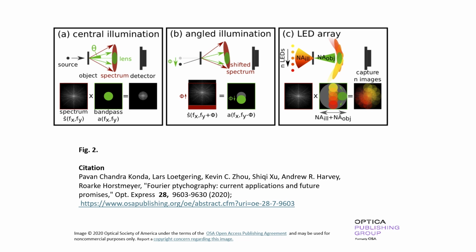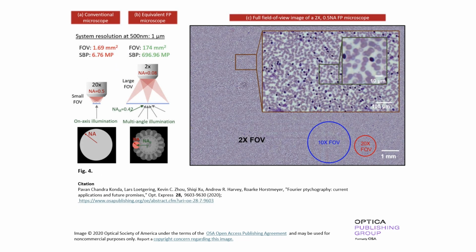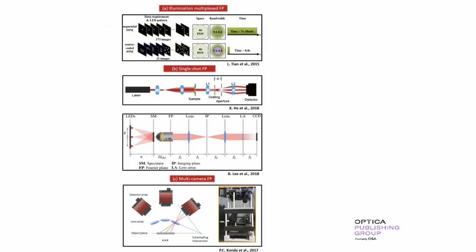But then the success that you see is like you saw in the introduction in the first slide, that by using this kind of multi-angle illumination, people achieve 10x improvements in object resolution, which is very interesting and dramatic. And you see all these different geometries where this could be obtained with structured illumination from different directions being the originally successful approach, but lately people are using camera arrays that have this shifted Fourier space, like you saw in the second slide in today's discussion.